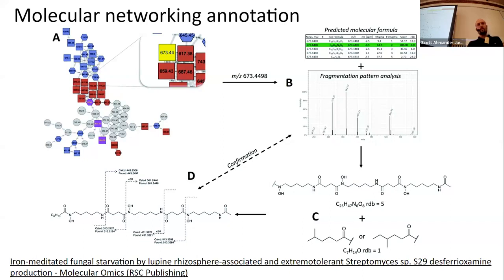Again, you have to be careful what type of compounds you're annotating. For a lot of the drug-like compounds that we might observe in the data today, there are only very few potential positions where some modifications can happen, oxidation, things like this. So it's also highly possible that the smaller your structure gets, the easier your annotations could become. But this is not a general rule. It depends on the complexity of the structure.